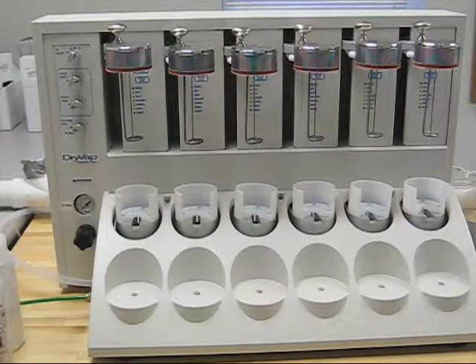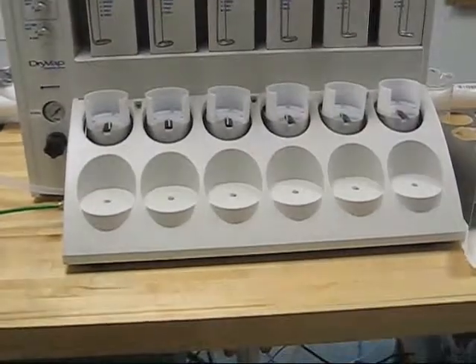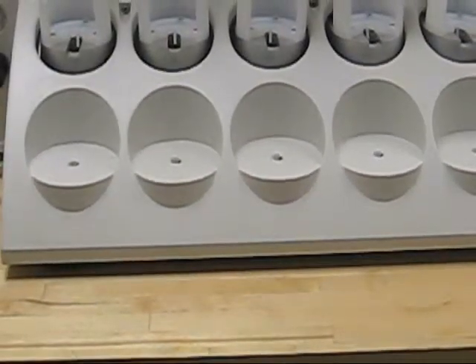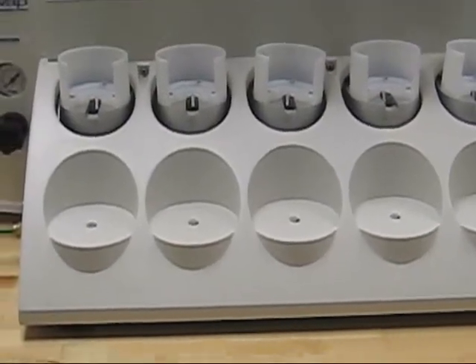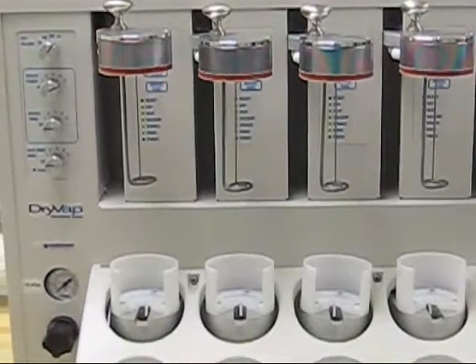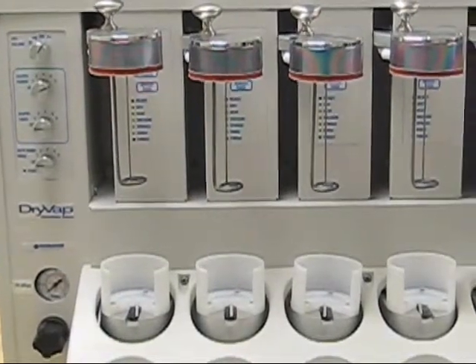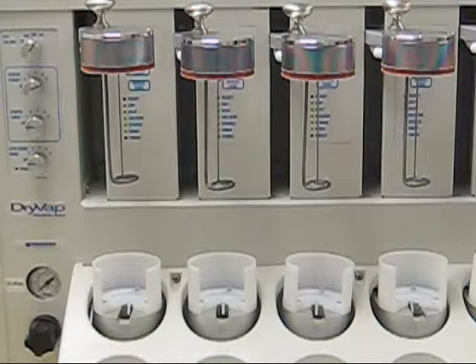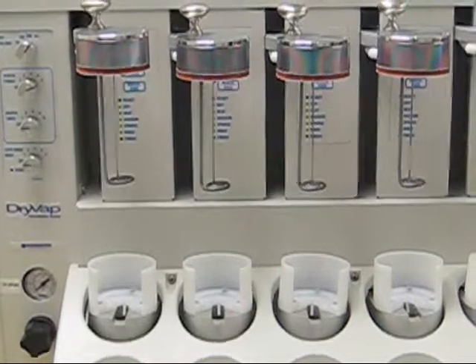The top knob is your drive volume. That will tell these valves in the front here, where your dry disks sit, how long to actually pull a vacuum on each individual station to remove water from your sample. The next down is the heater power. Most customers will leave that on heater power 5, which is 60 watts of power delivered to each of the stations.